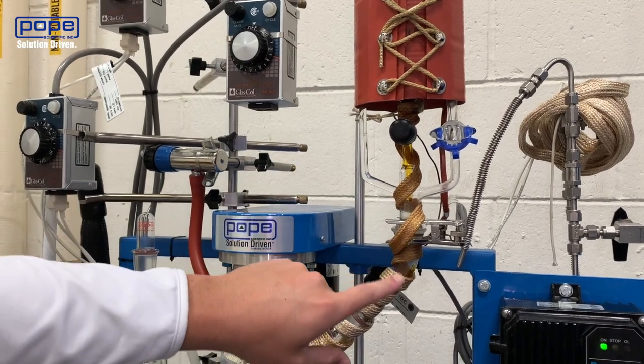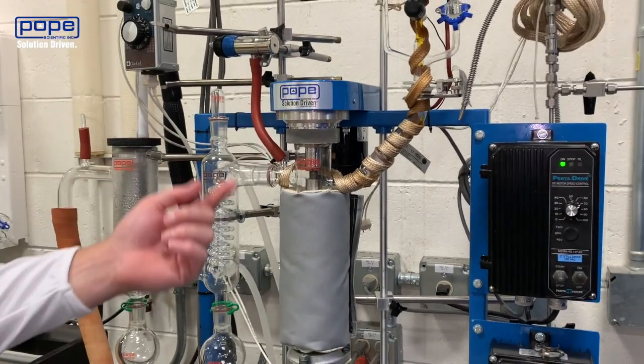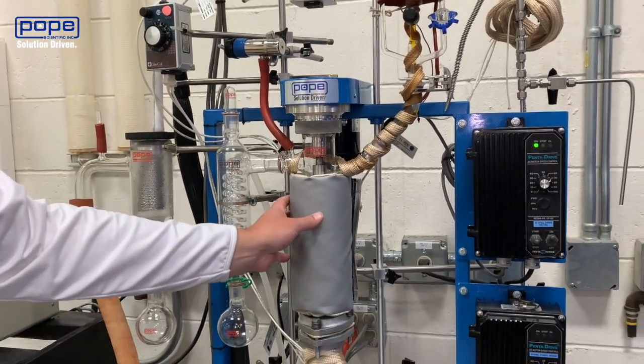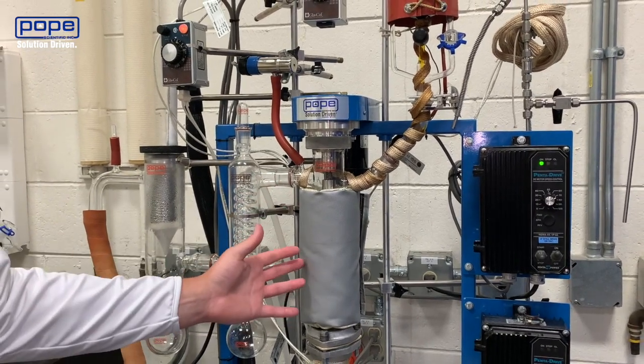The crude will then come down the arm of the main body and into the actual column. That's where it will be wiped around and then the heat from the main body is going to be distilling over your terpenes in this pass.